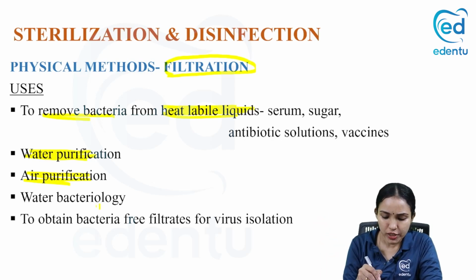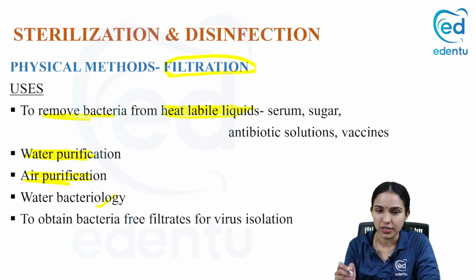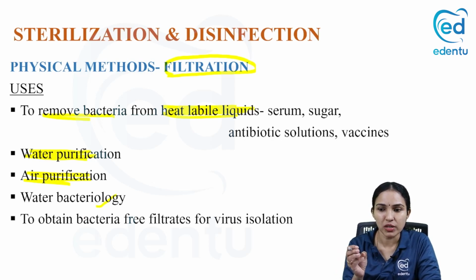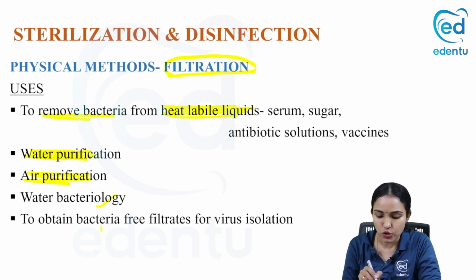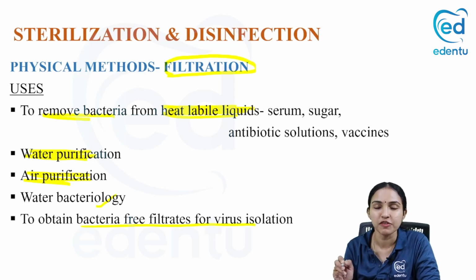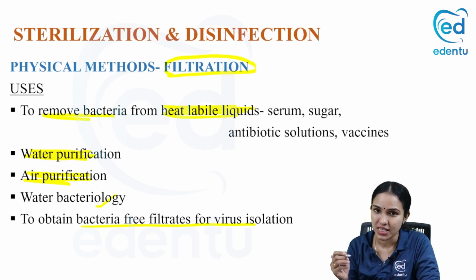In water bacteriology, you have an application because when you suspect that a particular water is contaminated with certain microbes and you want to know what kind of microbes are present in it, you subject this water to filtration. The filter will retain those microbes so that you can culture them easily. So that is the application in water bacteriology. Also, we do it to obtain bacteria-free filtrates for virus isolation. Suppose you are going to isolate virus from a sample, you want to remove all the bacteria from that sample.